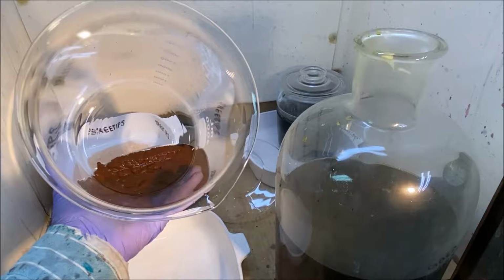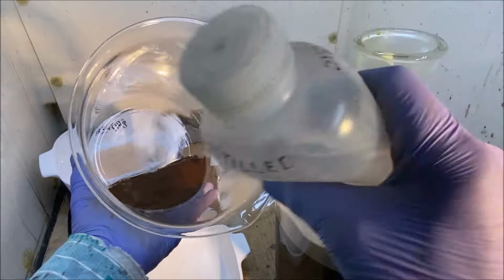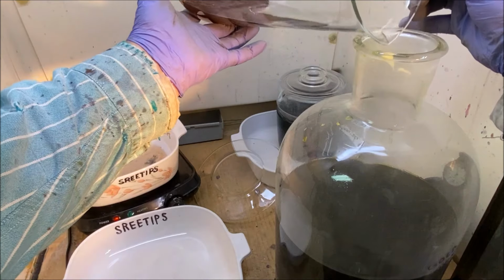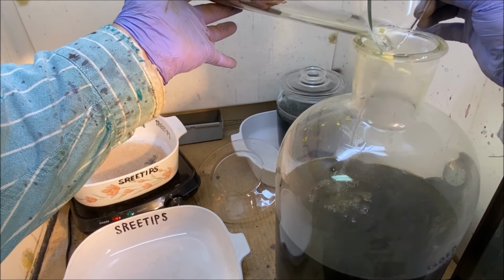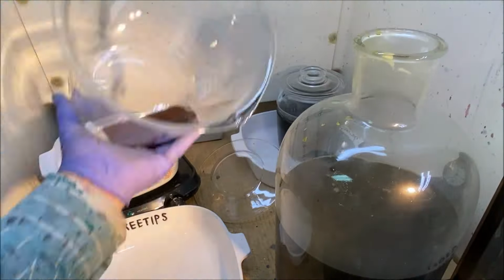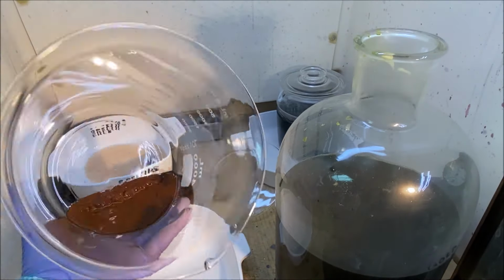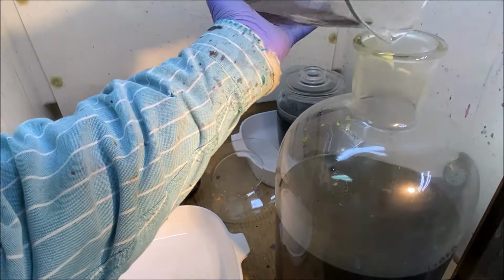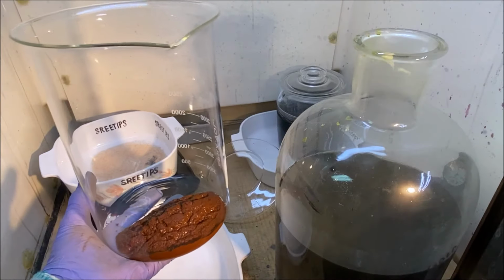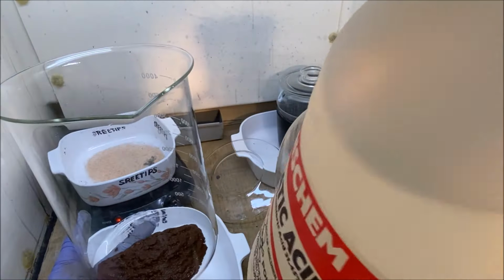Still seeing some yellow in these cold distilled water rinses, so I'm going to continue to rinse with distilled water until I get all that yellow color rinsed out of there. Okay, now the water rinses look colorless, and we're going to add some hydrochloric acid now and do some rinses with hydrochloric acid.